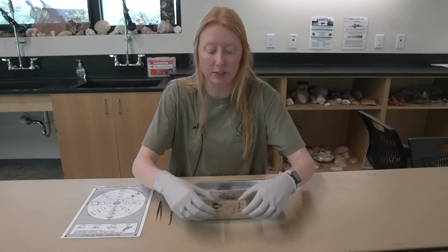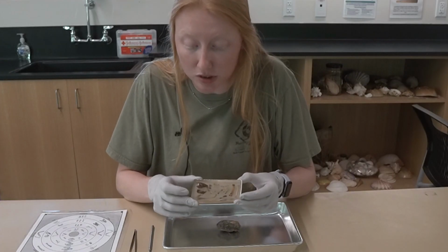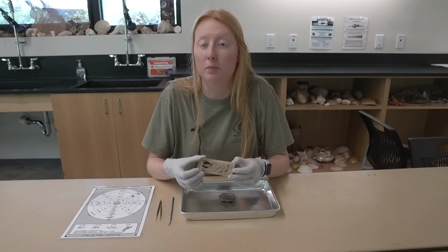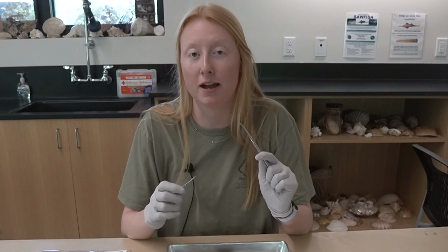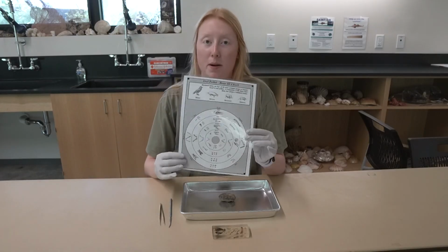So right here in this resin are examples of things that we can find. So different types of skulls, part of a jaw, ribs, and leg and arm bones. So really, really cool stuff that we will be able to look out for. Tools wise, we just have a pair of tweezers and a probe to move things around to try and break into the pellet. And once we find things, we can label them on our bone ID chart.